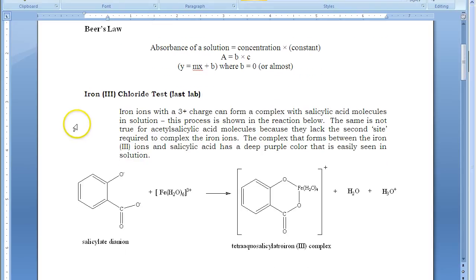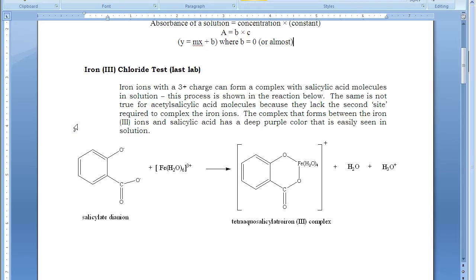We're going to use the iron-3 chloride test that you may recall from aspirin part 2 and then be able to quantify it with UV-Vis spectroscopy. If you remember from your aspirin part 2, when we have salicylic acid or salicylate ions in the presence of iron, which we introduced from iron-3 chloride, we form a complex.